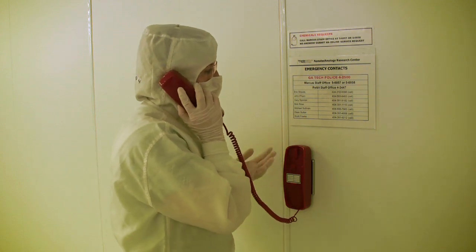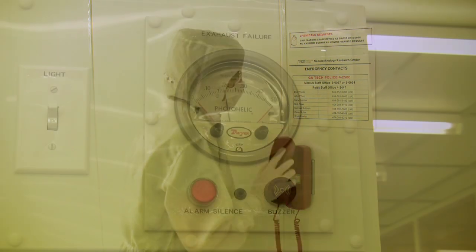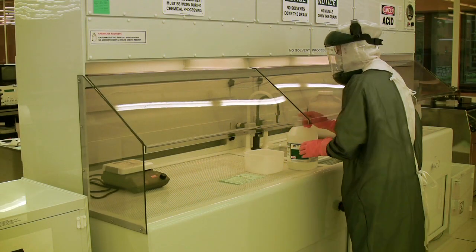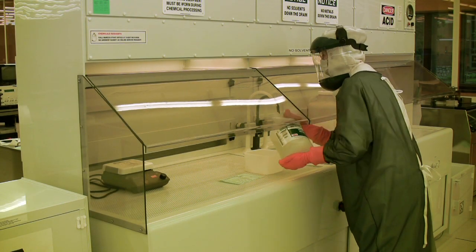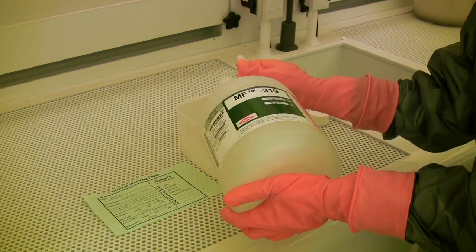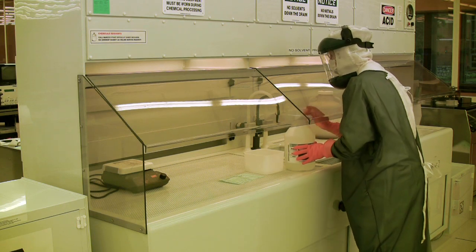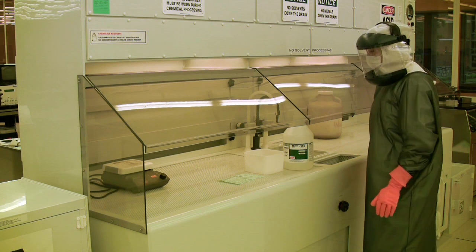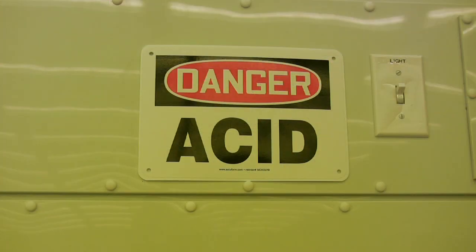Large chemical spills must always be handled by staff members. For your own safety, as well as the safety of others in the cleanroom, you should never use a fume hood that doesn't appear to be working properly. Likewise, you should never use one that is cluttered or has a large amount of spilled chemical in it. We don't want fumes to escape the fume hood, we don't want to create any potential for incompatible chemicals to mix, and we don't want any injuries from chemical exposure to be sustained.